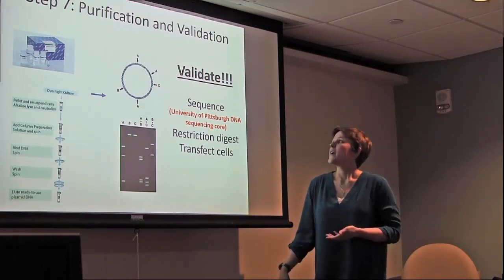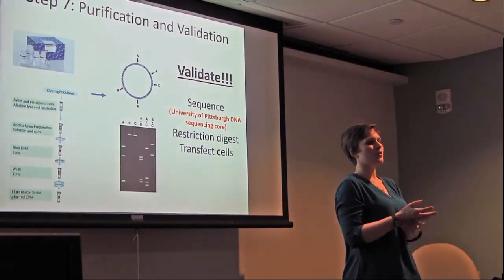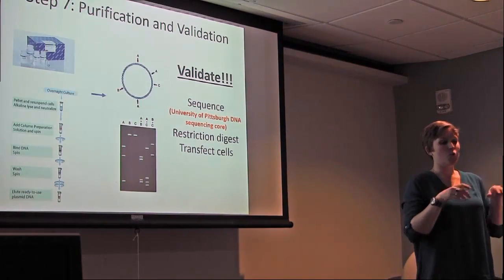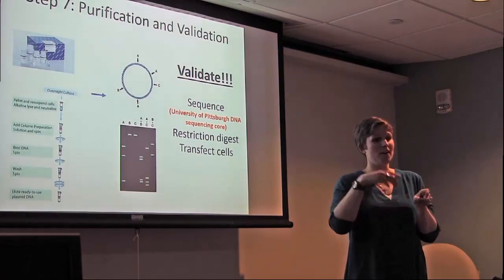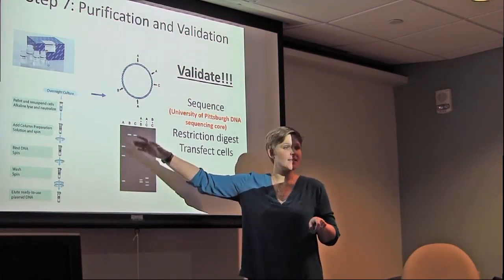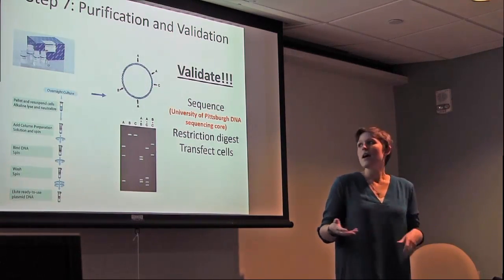And then if you have your plasmid, and again you went into Vector NTI with your whole plasmid and saw a bunch of different restriction sites that would give you certain size products, you can cut and you can see, well, if I cut in these places, am I getting the right size products?